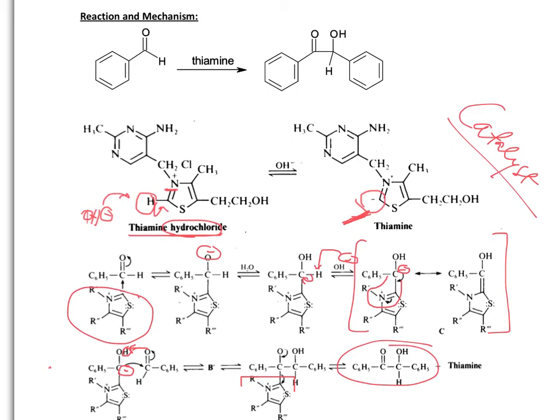Now, hopefully you can see that in both cases, the cyanide example that I gave you and of course the thiamine hydrochloride that we have, these are mild bases that I'm using. So these are groups that are nucleophilic in nature. They are mildly basic in nature. They have the capacity to carry out the attack at the electrophilic carbon, but when their job is done, essentially they will be lost from the system. So that bond between the carbon and the nucleophile must be broken. If that bond is too tight, essentially the reaction is not going to make it. Okay.